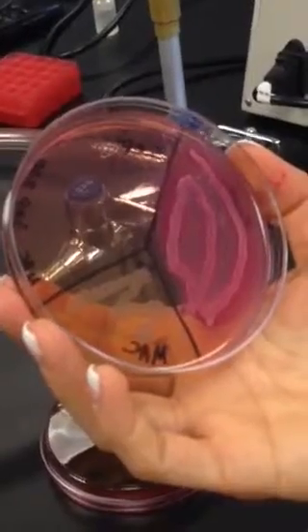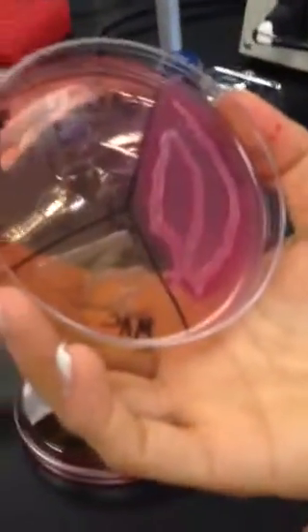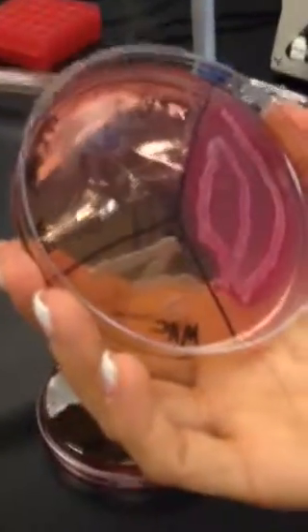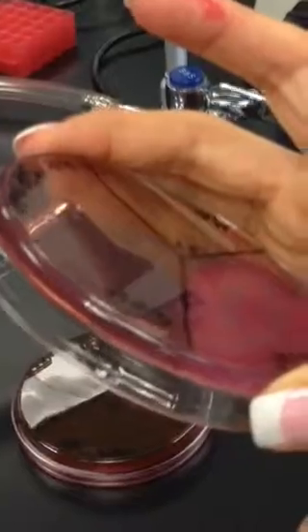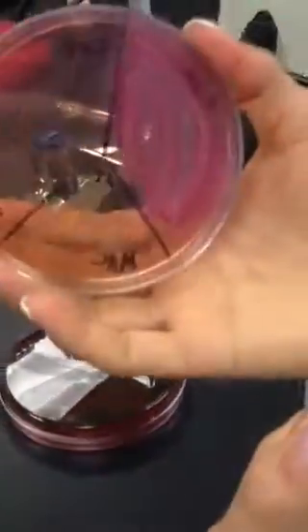If your E. coli known turns milky pink and your unknown on the MacConkey agar also turned milky pink, it could be E. coli. Especially if you also have the shiny green on your EMB agar. Get it? It might be salmonella, it's just growing, but it's not getting a color change.